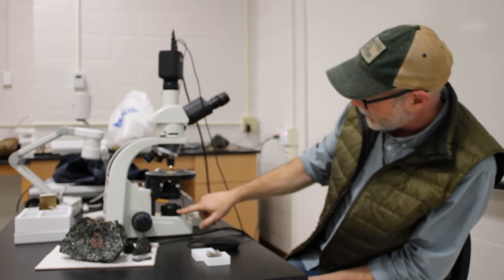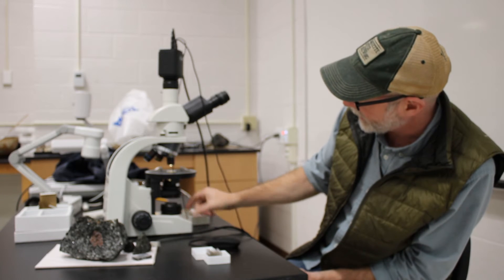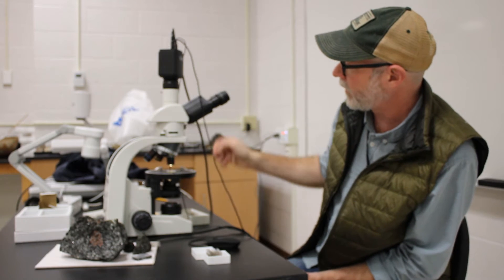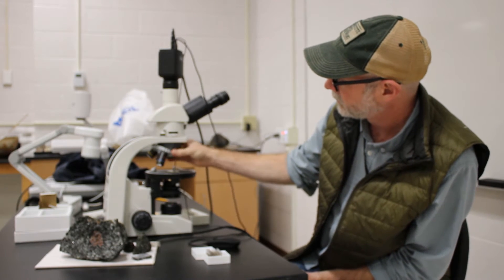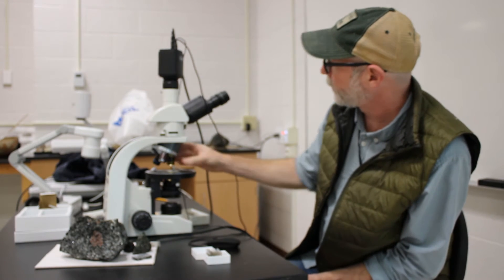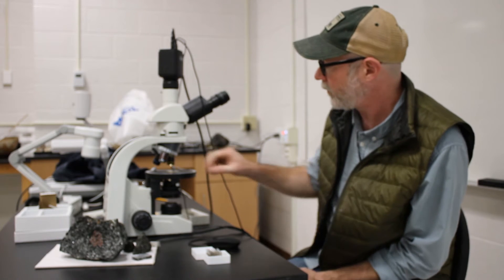The petrographic microscope really just means a microscope for looking at rocks. The thin sections are thin enough for light to shine through. We have a bottom light and it's polarized light. We have a top light which we can turn a polarizer on and off. And then we have multiple magnification possibilities. There are different kinds of lenses, but those are the basics — those are our most simple kinds of observations we can make.